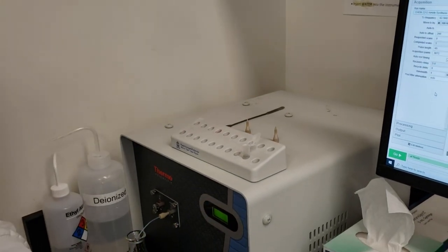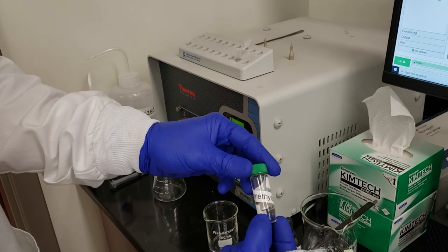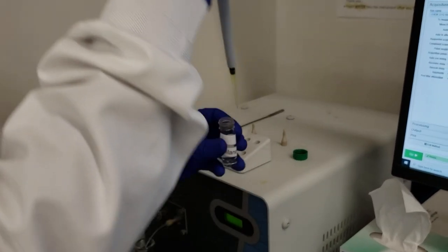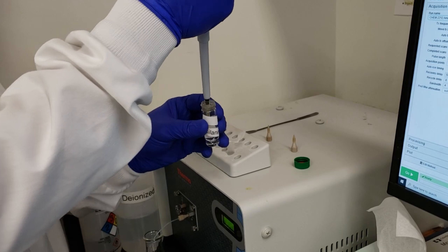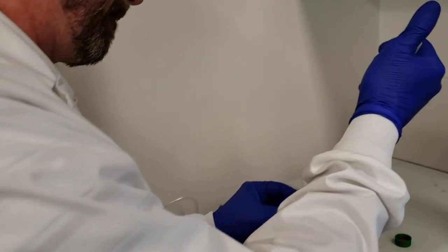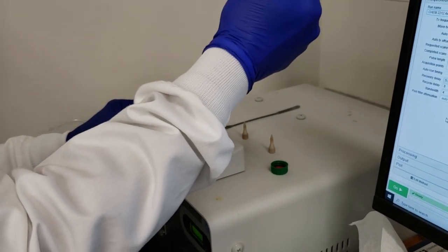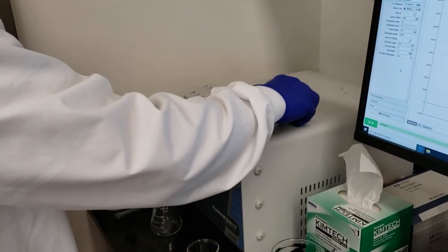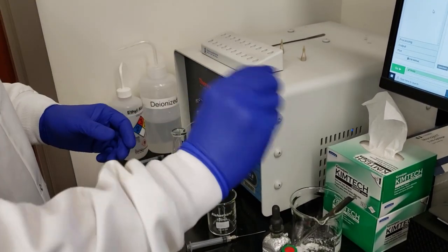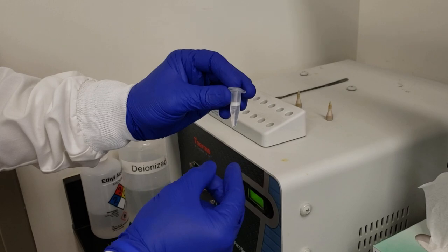Final step for preparing our sample is to add in a little bit of TMS. This is our tetramethyl silane. This is our standard. I'm going to use my micropipette here. Couple of drops. Go ahead and cap that up and then we're ready to go. I'll give it one last mix before we inject. Okay, so everything's dissolved. Looks pretty good.